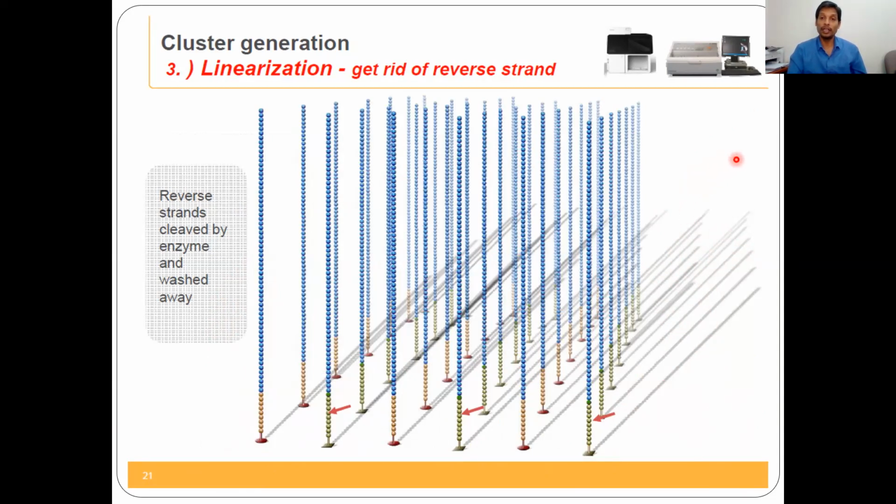It is generated from an entirely different DNA fragment. This one cluster is all generated from one DNA sequence, and after a few primers you get another cluster, generated from a different original DNA. I hope you are understanding.